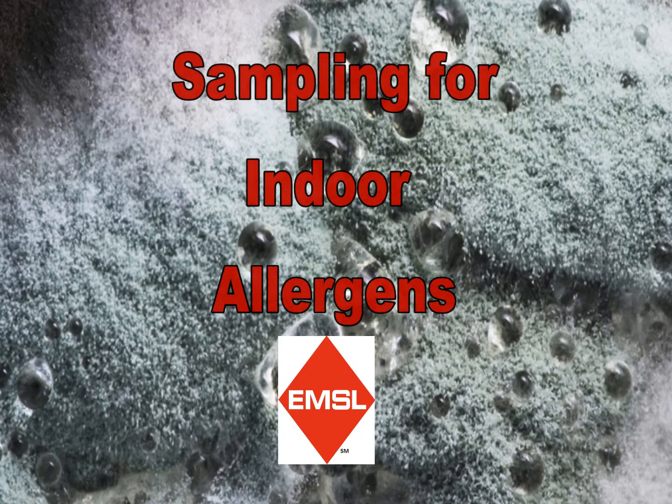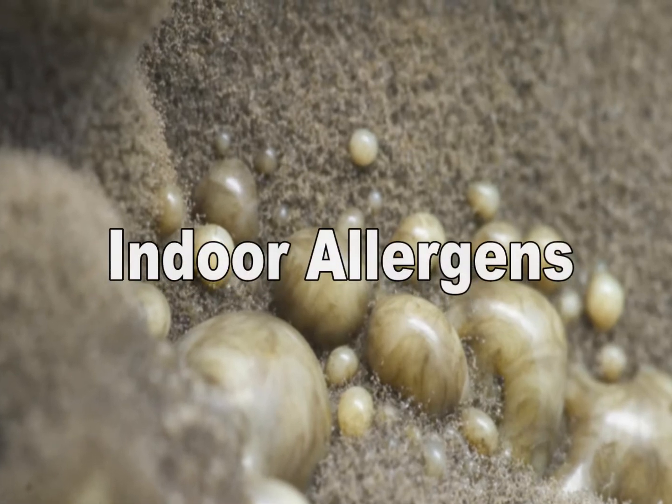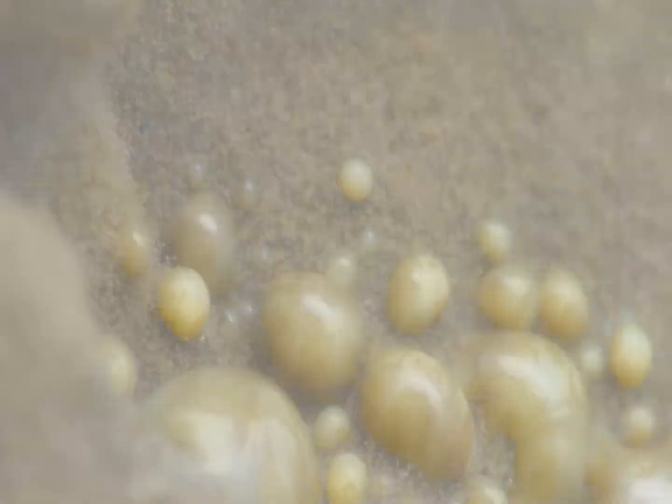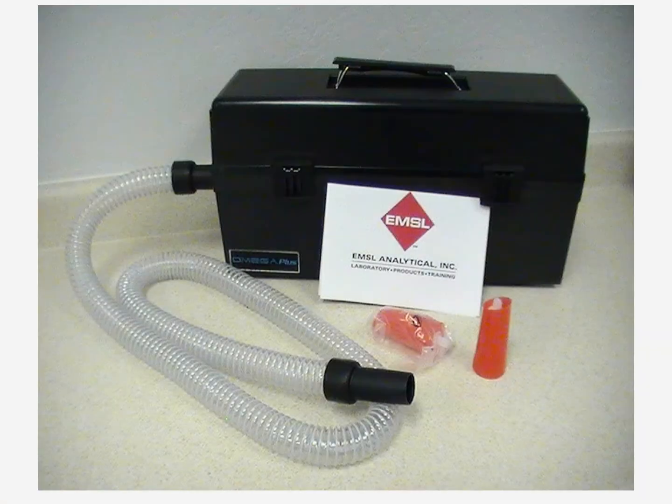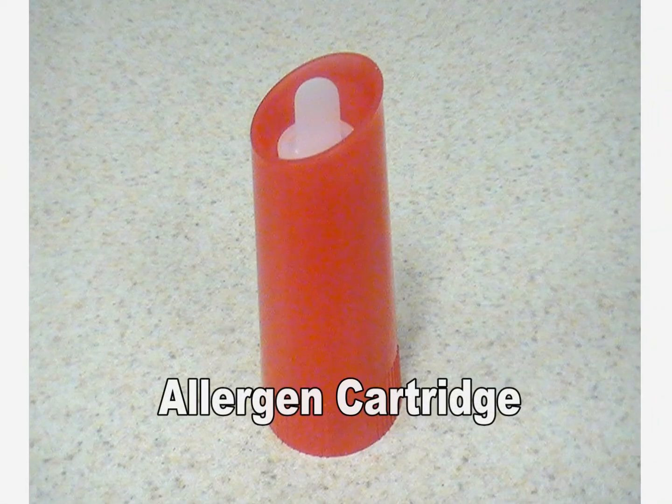Welcome to EMSL's product videos. To sample for indoor allergens, you will need a HEPA vacuum with a round hose connection and an allergen cartridge for each sample to be taken.